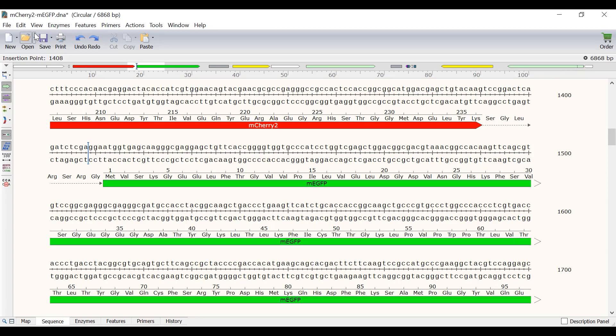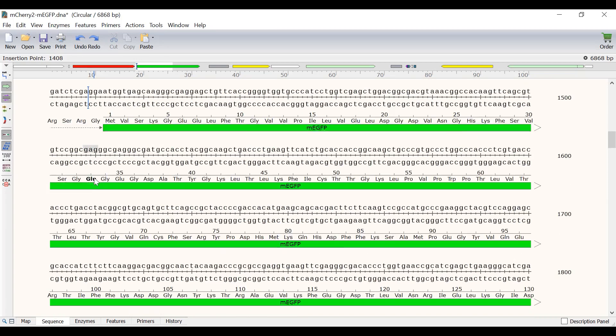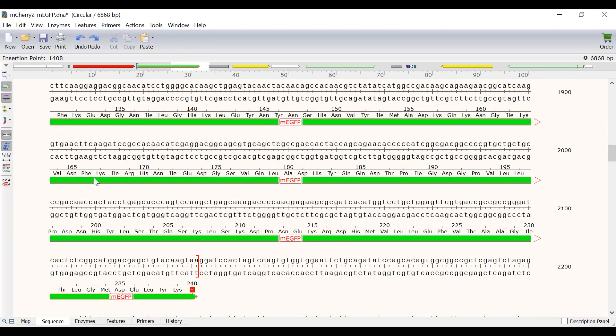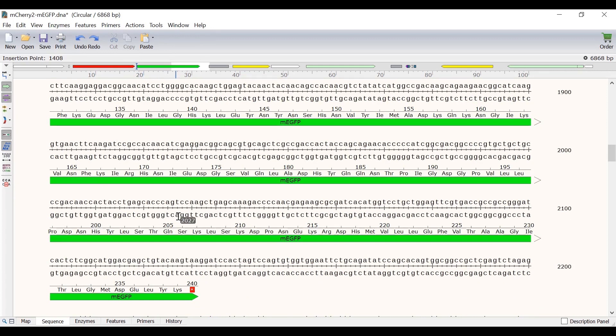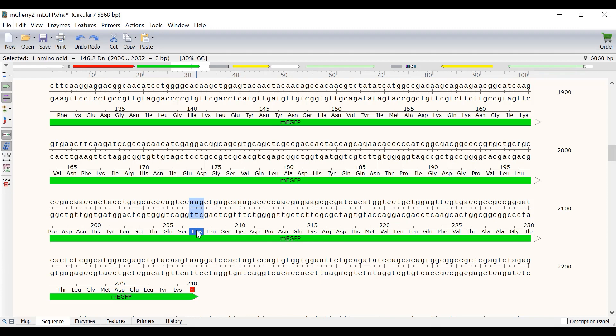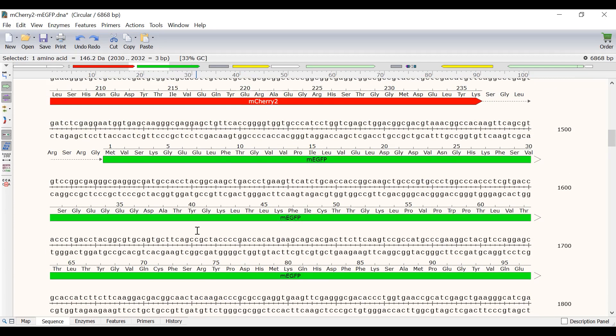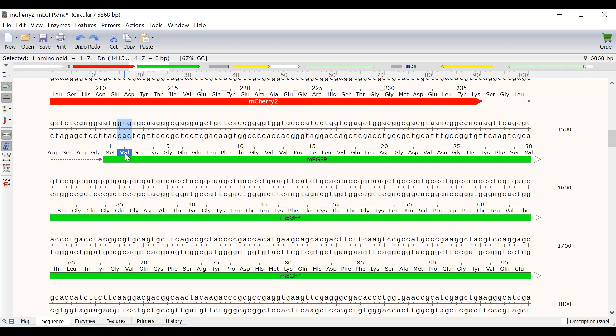In the last part of this tutorial, I will show you how to manually skip over translated segments. For example, this form of EGFP is monomeric because it has an alanine to lysine mutation at position 206. However, in this case, the lysine is at position 207 instead. And this is because monomeric EGFP has an extra valine just after the start codon. I would like to edit the monomeric EGFP feature so that it follows the conventional numbering of GFP. So this valine will be skipped.